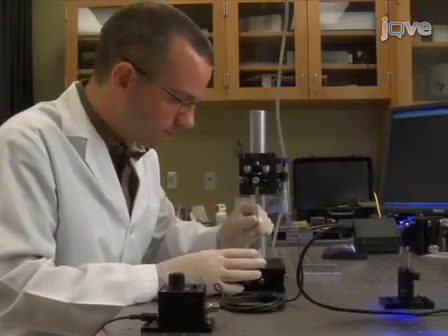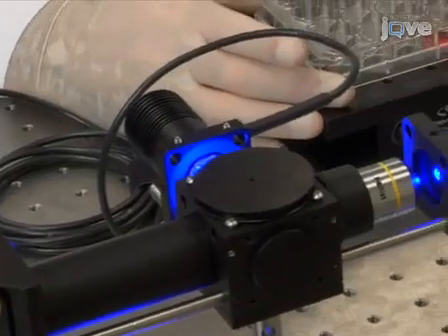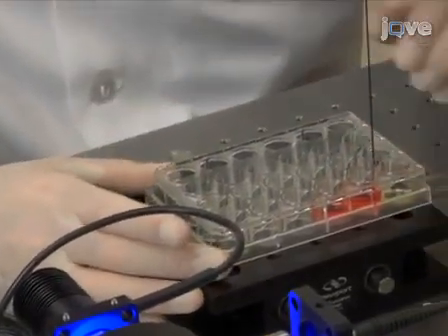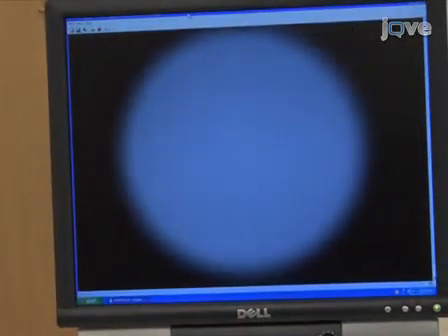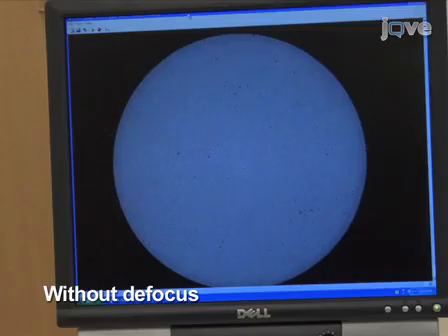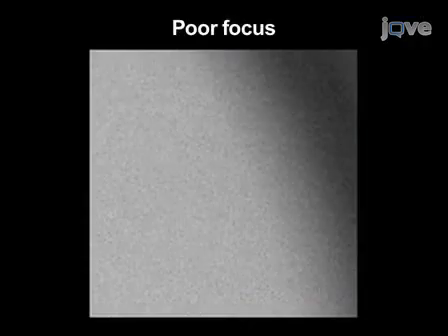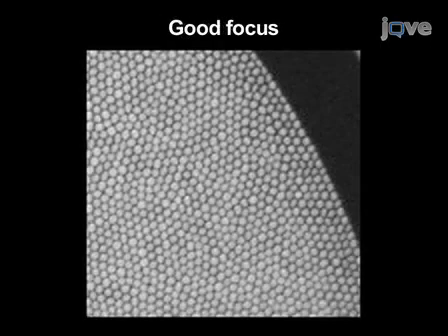When assembled correctly, the microendoscope will operate as an epifluorescence microscope, relayed through a coherent fiber optic bundle. For optimal imaging results, attention should be paid to ensuring that three key conditions are met. First, the proximal face of the fiber bundle should be imaged onto the CCD camera without defocus, in order to achieve the full resolution of the system. Here, a portion of a fiber bundle is imaged with poor focus, slight defocus, and good focus. The optimum focus is found by adjusting the axial position of the objective lens relative to the bundle face.